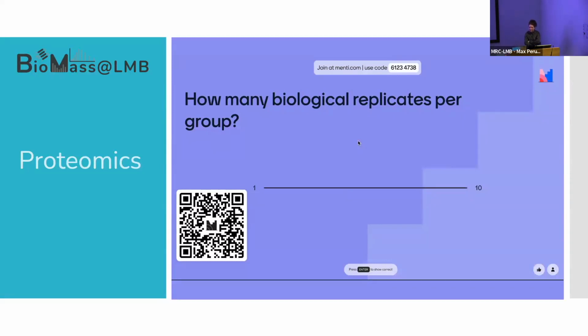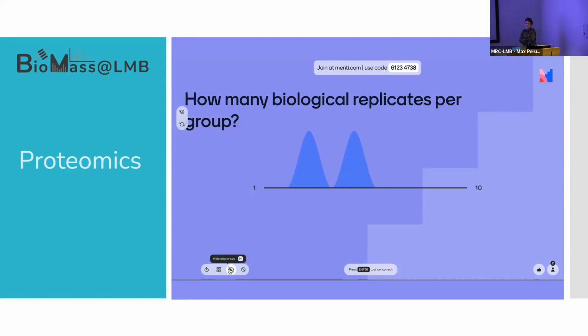Question for you, the same scheme. Right, so I'm going to tell you, it depends on the experiment. It depends on your system. It depends on the variability of your samples. If you're working with cell culture, usually the biological variability is quite low. So you'll probably be okay if you're giving me 3 biological replicates. If you're coming to me and saying, look, I've just tried this experiment, I have no idea if it works. Is it okay if I bring you just 1 sample? Yeah, that's absolutely fine, as long as you don't want to do any statistical analysis on it.